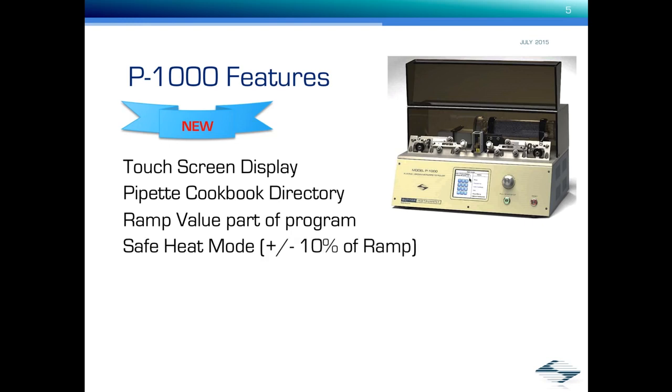There's a safe heat mode. This is nice too. It keeps you from burning out the filament. You don't want to do that, and so the safe heat mode prevents you from putting in heat settings that are way too low or way too high.